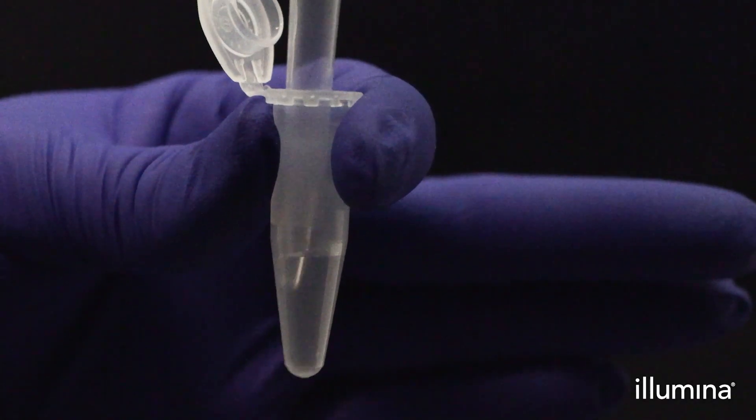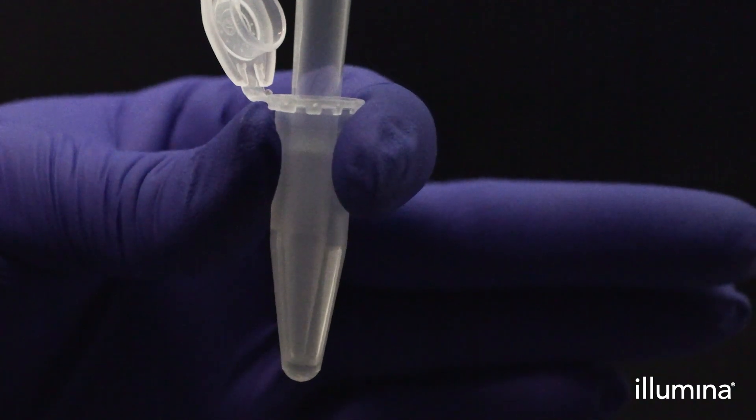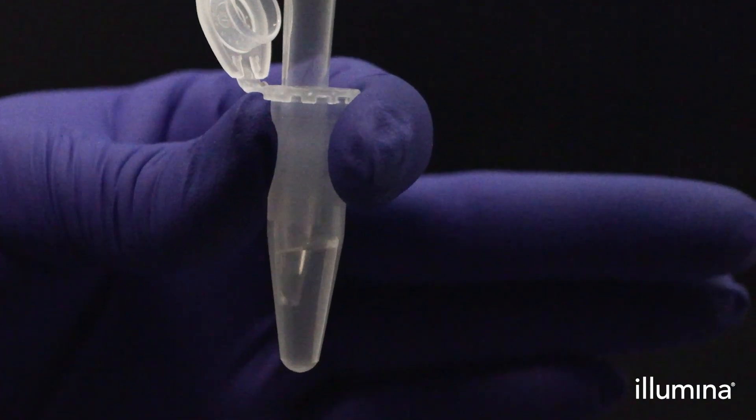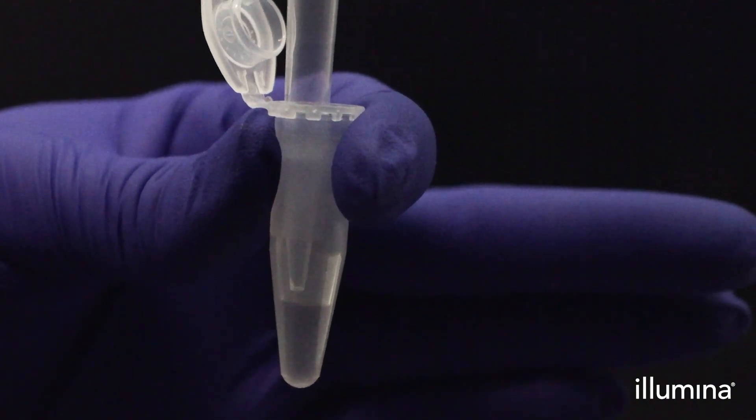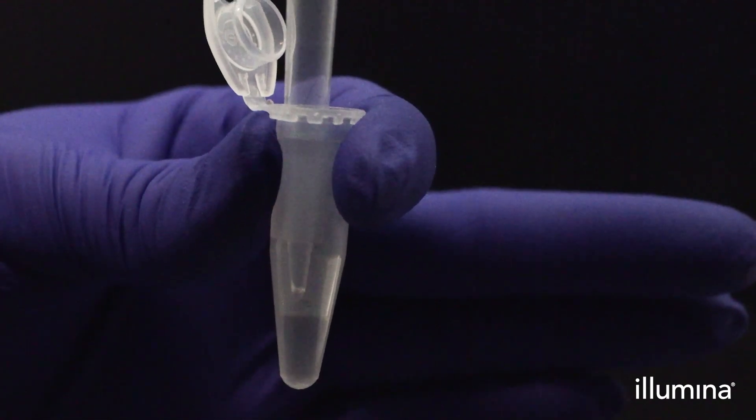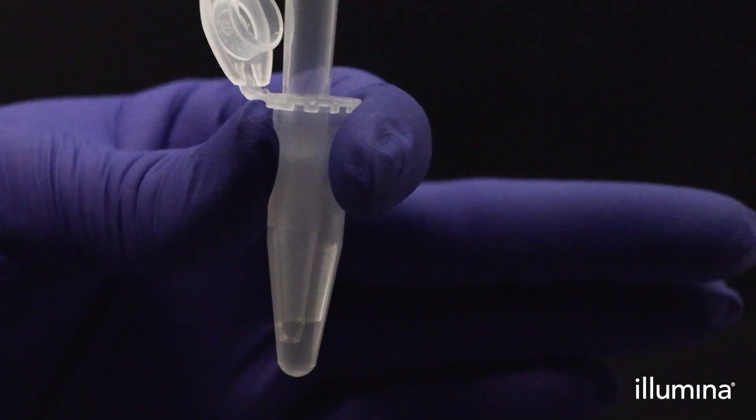First, gently pipette mix your cell or nuclei suspension 10 times with a wide-bore P200 pipette tip. The cell or nuclei suspension should be freshly mixed before transferring into the pips to prevent settling from impacting your sample loading.